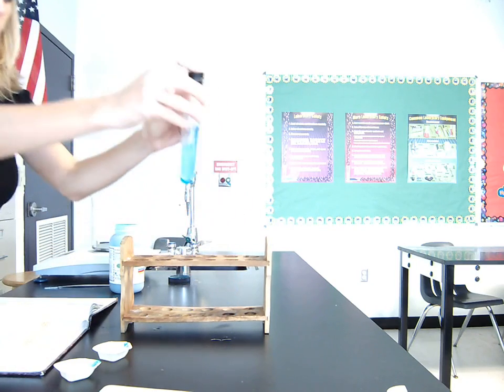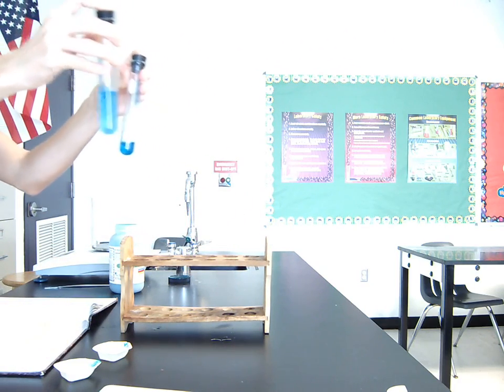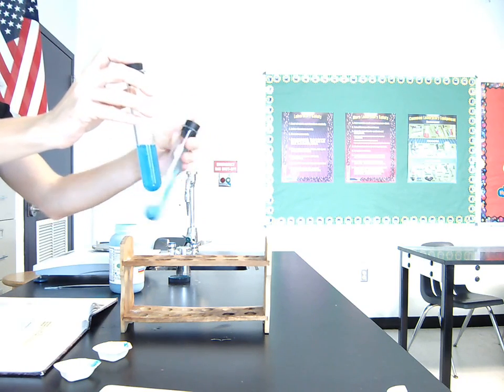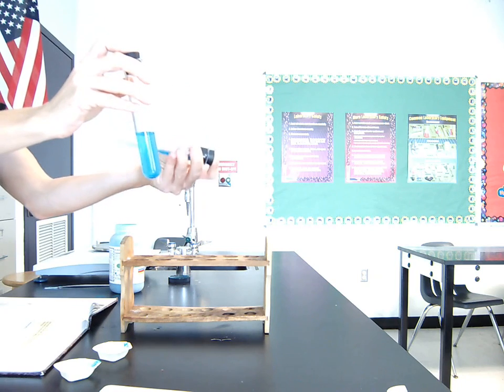Okay, now the fun part. We get to shake. Try to keep it on camera. Shake, shake, shake. Sometimes it gets stuck to the side of the test tube though.